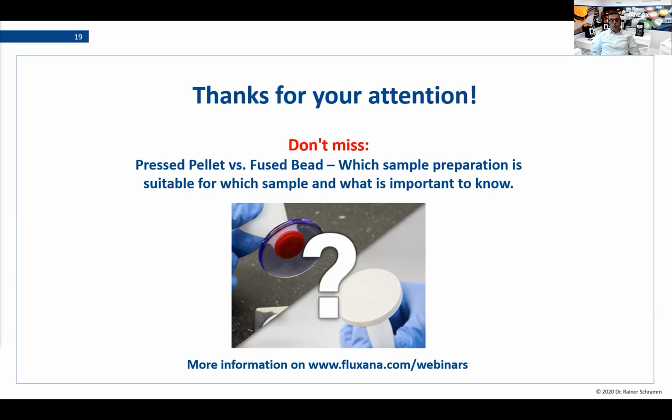How can we introduce high and low points of the drift correction samples in the calibration curve? That's a bit different in every software. So probably we should discuss this over the forum in the course, or you send me an email. I think we have to discuss it separately because I have to know what software you're using, and then I can give you a better answer.